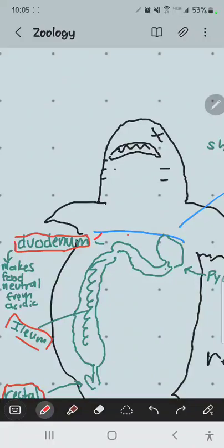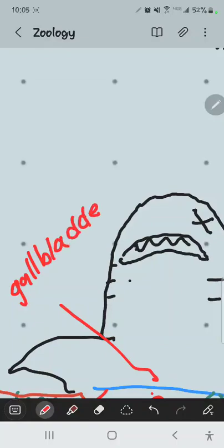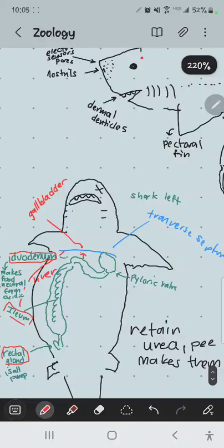The gallbladder is in the middle of the liver lobes. And what you'll see is the gallbladder hopefully will have some bile in it. And bile, similar to bilirubin, but bile is created or stored in the gallbladder. And what happens is bile is secreted into the duodenum along with enzymes from the pancreas, and that's for emulsifying fats.